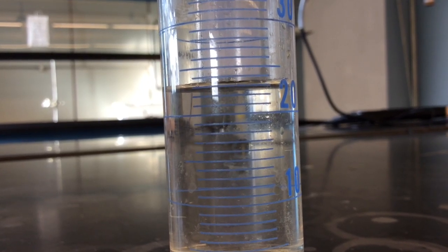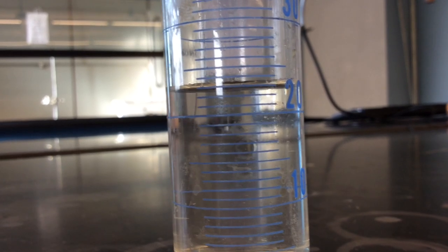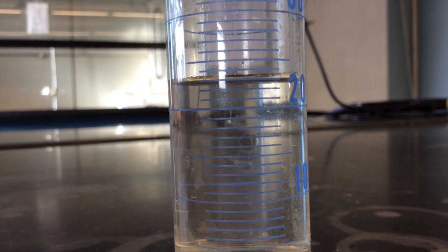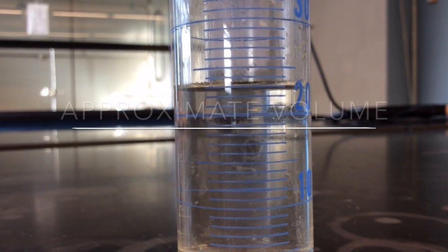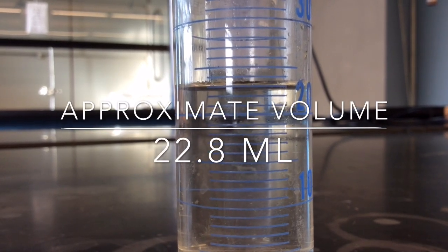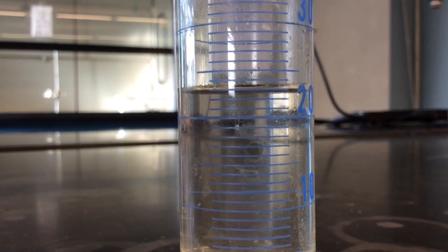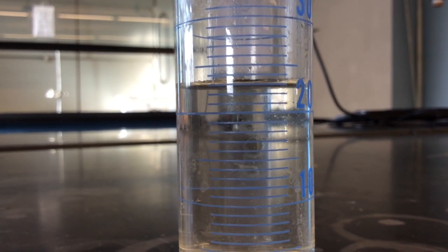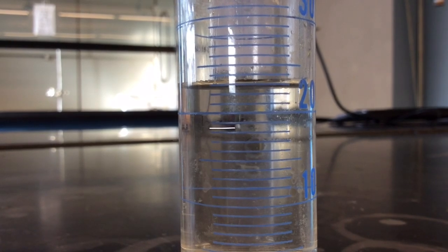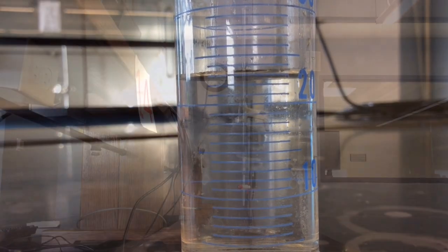As with the beaker, you always read to the bottom of the meniscus. In this case, the bottom of the meniscus appears to be just below the 23 line, so I would judge that this volume is 22.8 milliliters. Since somebody might disagree with me and they might think this is 22.9 milliliters and somebody else might think it's 22.7 milliliters, recording the volume any more precisely would be incorrect.